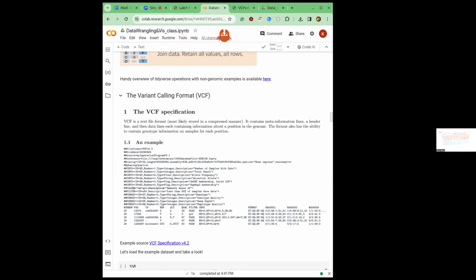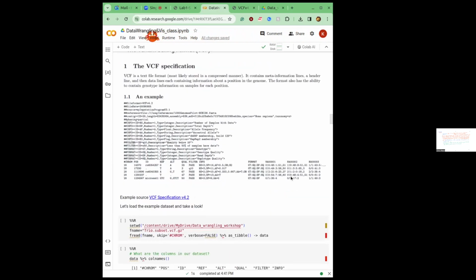That's why we actually didn't go into the discussion of what the quality scores mean, because the quality scores themselves have a much longer history, and that is kind of appropriate for a lecture setting. But for a long time with the nanopore systems, you were getting Phred scores on average between 10 and 20. And at those sort of score levels, the amount of coverage that you need over a particular region to confidently call a specific single nucleotide polymorphism is quite large. Especially if it's an allele in a population that's only perhaps represented half of the time, you typically need very high coverage, which is maybe more than what you could get on your average MinION, although you could get it on your bigger PromethION.